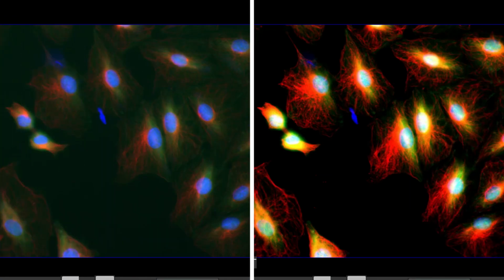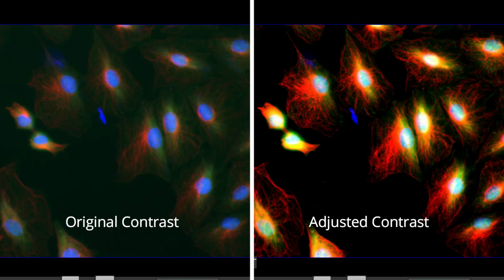By manually defining the contrast range and adjusting the overlay, we are able to improve the overall appearance of overlay images generated within Athena.